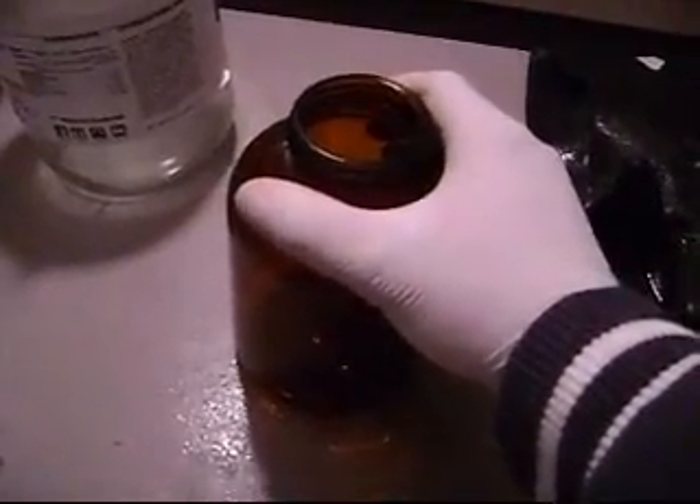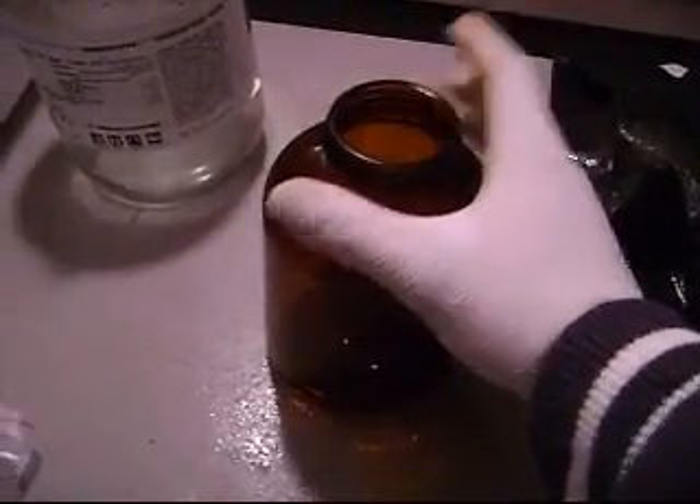This is an amber bottle covered in plastic. Then I'll put it in the freezer for two to three hours, and I will get back with you after that is done.